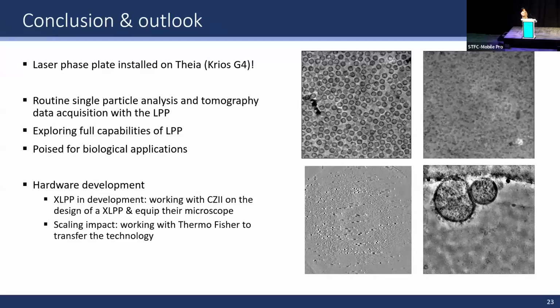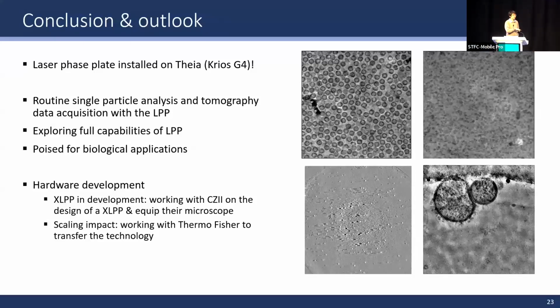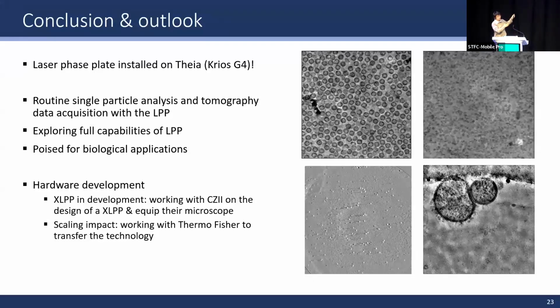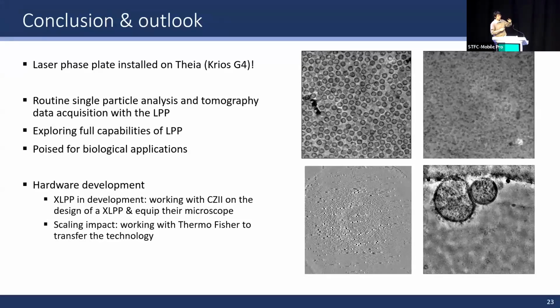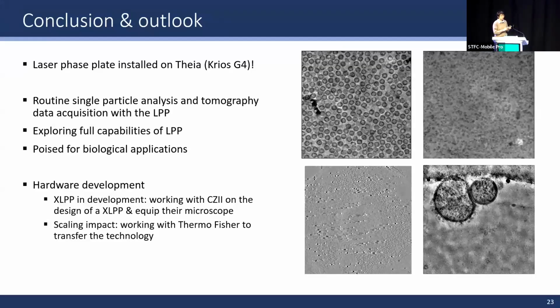I guess there are two parts to that. The first part, I would say that the microscope aberration plays a part in the B factor, and that's why we see the difference. It sort of depends on how you define that, but aggregate on aggregate, that's what we see. The laser on and laser off comparisons are both with the transfer optics on, and in that case the B factor is really comparable. There's a slight offset, which we don't fully understand. It could be the orientation estimates being slightly different, but I would say those are comparable, so there's no difference in those two. Does that answer your question? Okay.